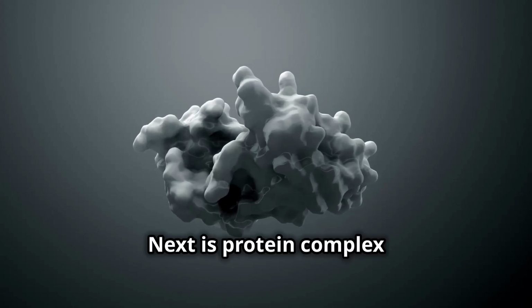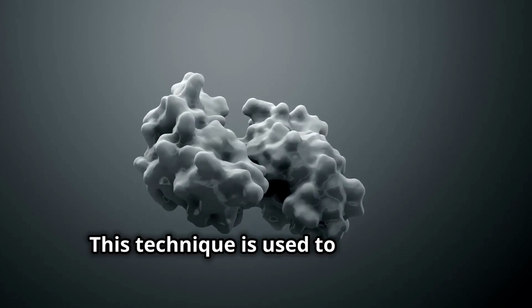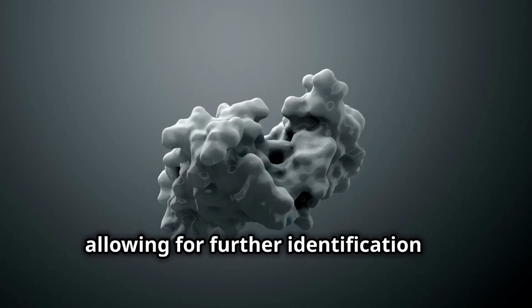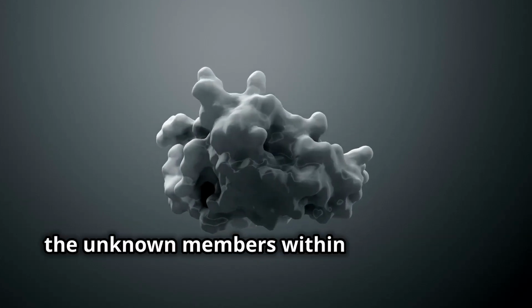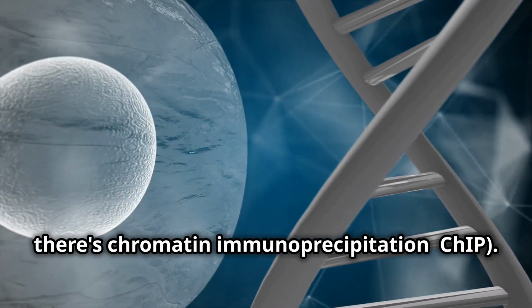Next is protein complex immunoprecipitation, co-IP. This technique is used to pull intact protein complexes out of solution, allowing for further identification of the unknown members within that complex. Then there's chromatin immunoprecipitation, ChIP.